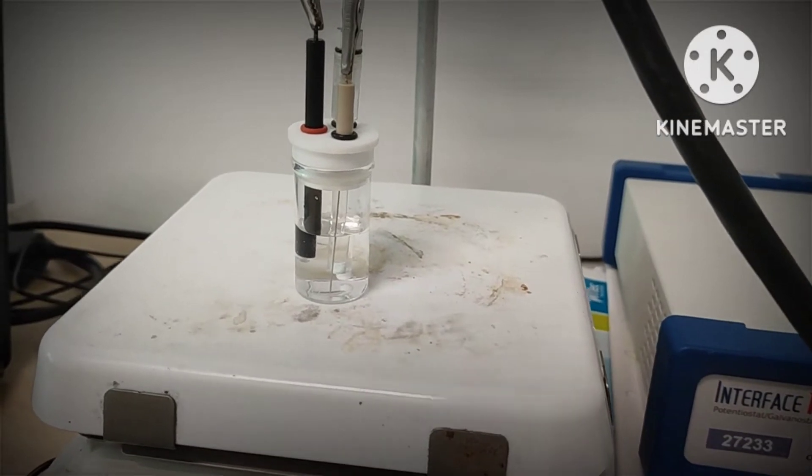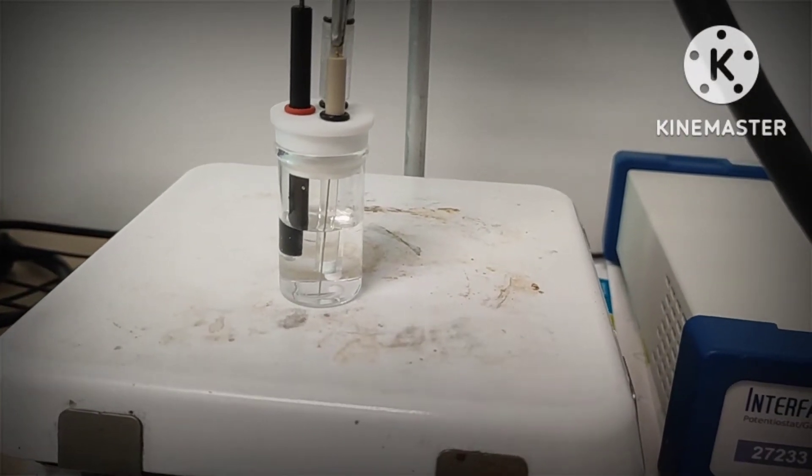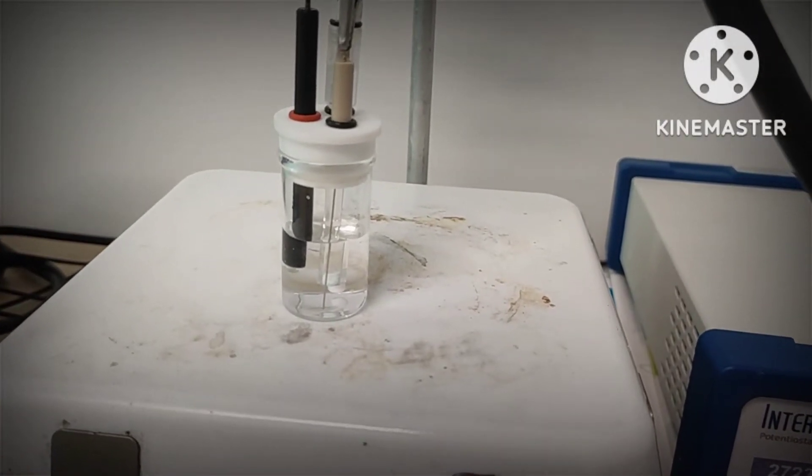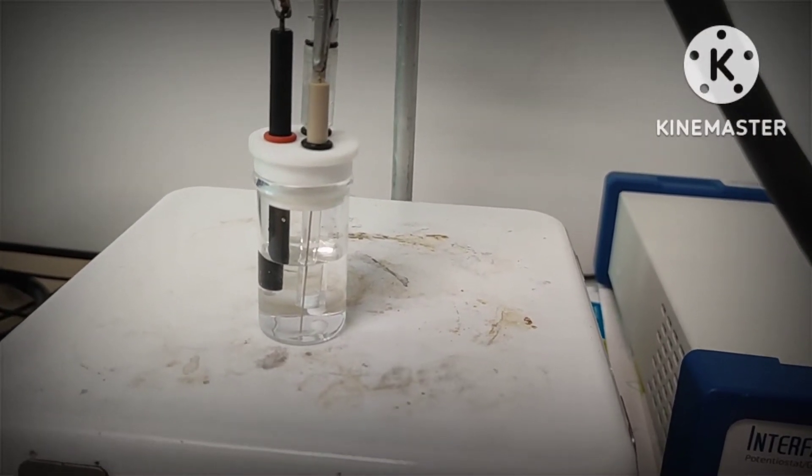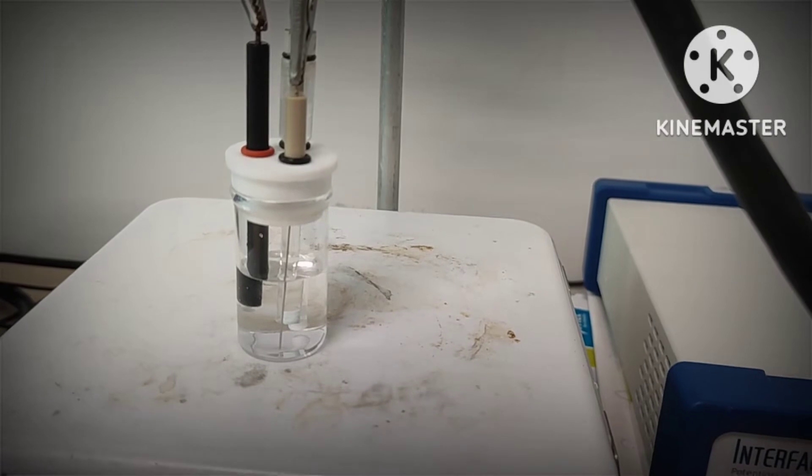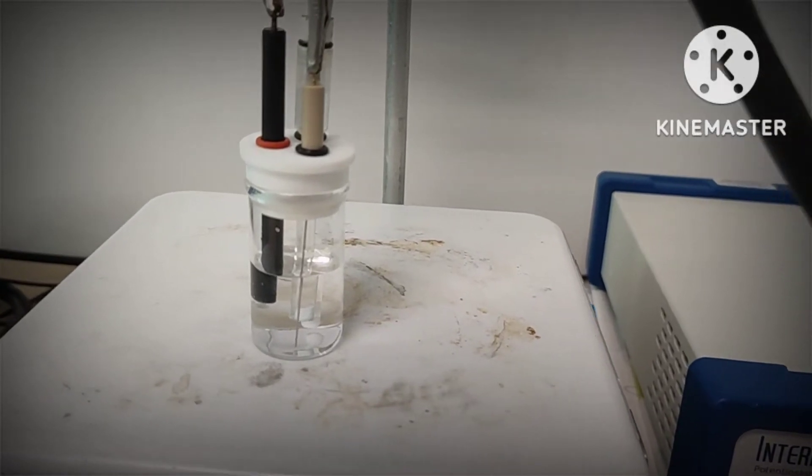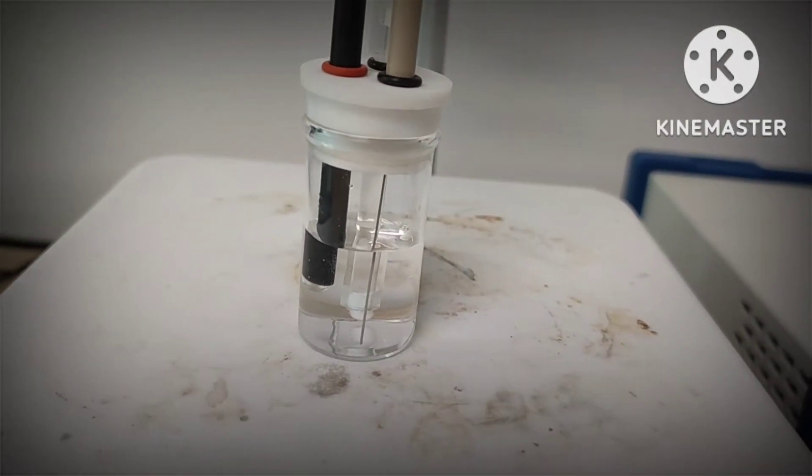The solution you can find here is 1 molar sulfuric acid. We have here the counter electrode which is a platinum wire, and also the reference electrode, I think SCE, the saturated calomel electrode. The black one is the GCE electrode as a working electrode.